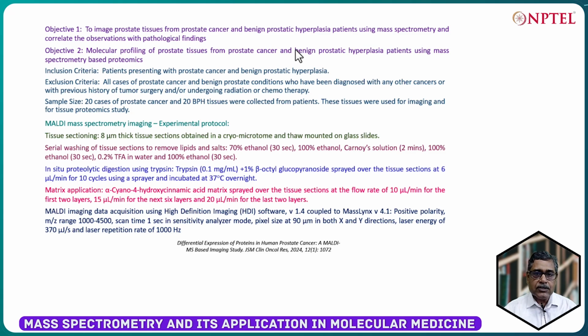Mass spectrometry based imaging is emerging gradually. I do not know exactly when it will happen, but down the line it will definitely come to diagnostics, because of its greater specificity and fewer false positive or negative results. But for the time being, we are just studying it for academic purposes, and if we see any scope opportunistically, then we will think of transferring the technology to diagnostics. That is the main motto.